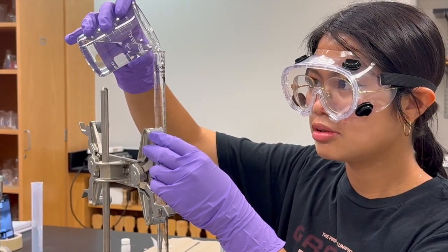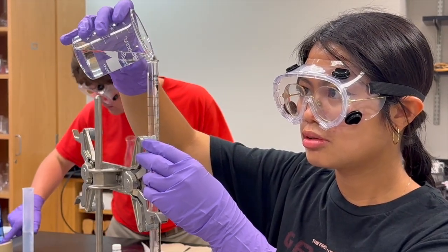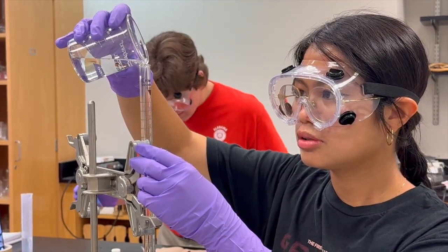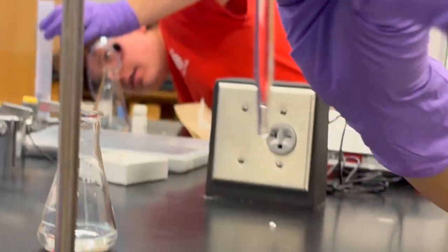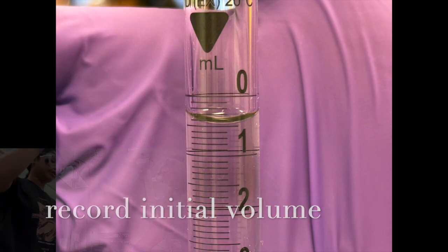For the duration of each trial, sodium hydroxide should not be re-added to the burette until the titration is complete. If more is added, accuracy can be compromised. To avoid this, one should fill until the 0.5 milliliter marking on the burette. Before recording the volume, drain a little solution or flick the tip to get rid of air bubbles. Here in trial 1, we have an initial volume of 0.48 milliliters.